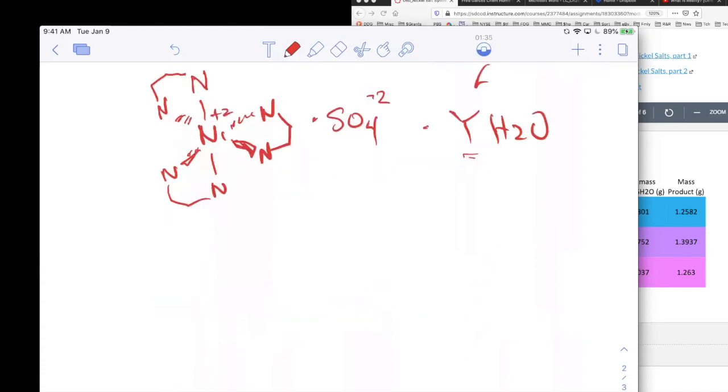Professor? Yes. I have a quick question. In the lab manual, it says Y is 0, 1, 2, or 3. So could it be 0? Yes, it could be 0. Exactly. Which means that it's perfectly dry and there are no hydrates. So Y could be 0, 1, 2, or 3, or 10. I don't think I give you that in this particular case, since I'm the one that generated the data, but certainly it's going to be 0, 1, 2, 3, or some number less than 5. All right, thank you. Okay.